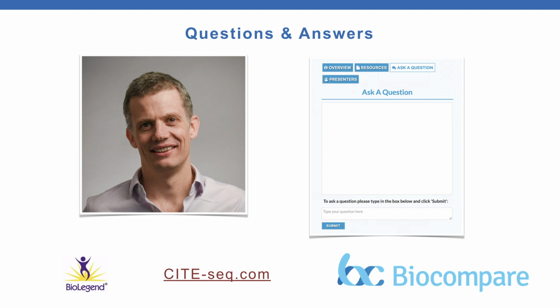All right, Peter, another question. Is CITE-seq compatible with systems other than 10x Genomics?